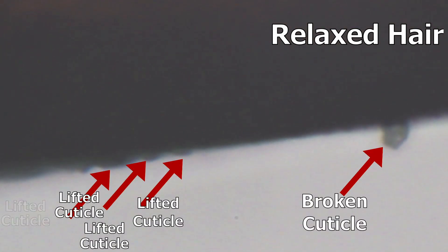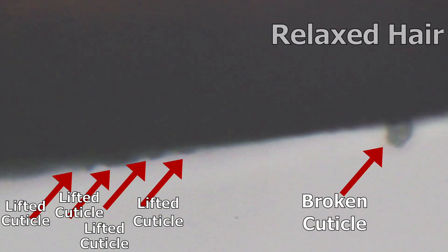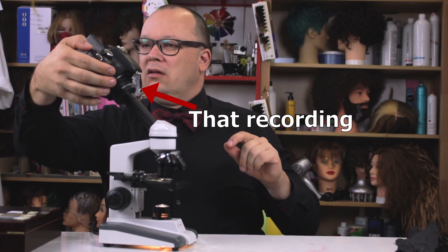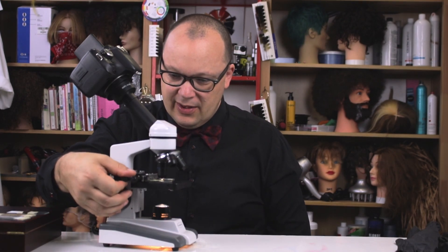You can see way over there on the edge of the screen some cuticle that's been compromised. Let's see if I can slide the slide over with one of my little dials here. I'm going to see if I can snap some pictures too. I'm going to shut the recording off and try to focus in with a picture, because with a picture I can edit for contrast and maybe see a little bit better. I'm going to move the slide around and see if maybe I can catch a piece of hair that's a little easier to see.